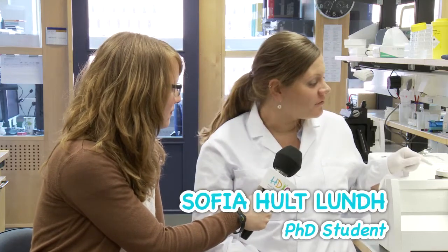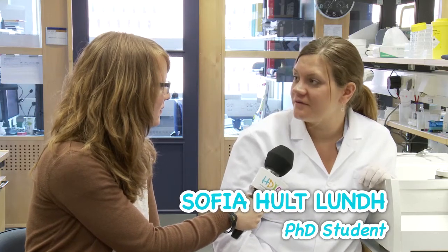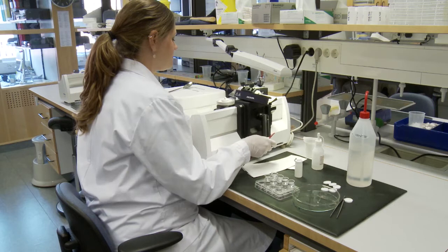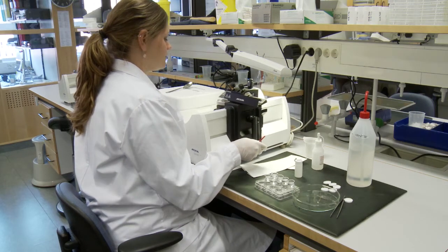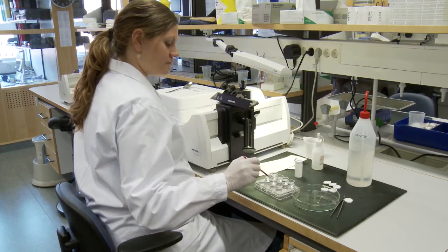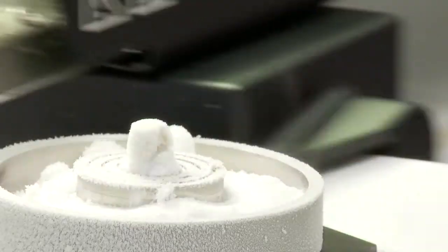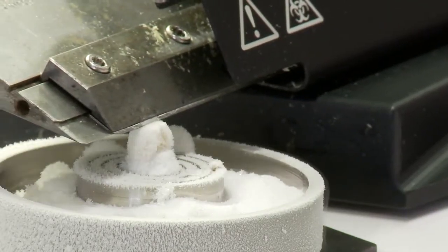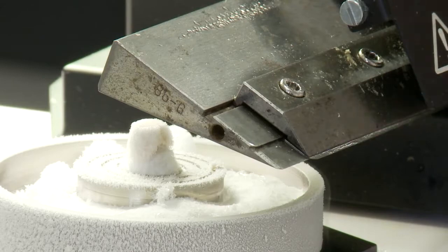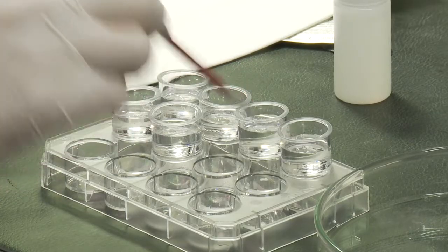So, Sofia, what is it that you are doing here? So here I'm sectioning a mouse brain, so I'm cutting it into very, very thin sections. Okay. And why do you do that? So we want to look at what happens in the brain, and then we cannot look at the whole brain at once. We need it in really, really thin sections. So here I cut them at 35 micrometers, so it's very thin. So it's about 30 sections in one millimeter.